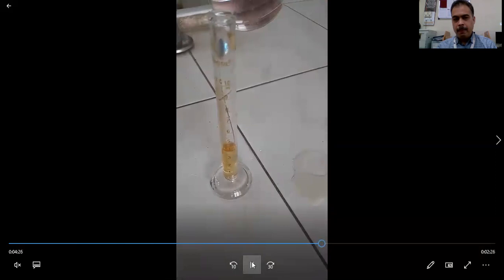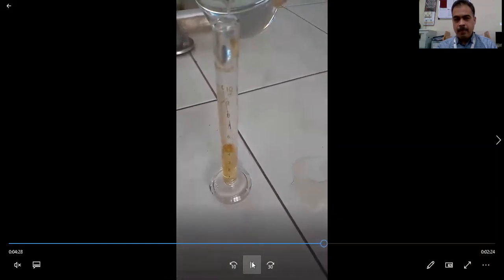Then for the 4th, 4 ml filtrate and 6 ml water. For the 3rd test tube, 3 ml filtrate and 7 ml water.